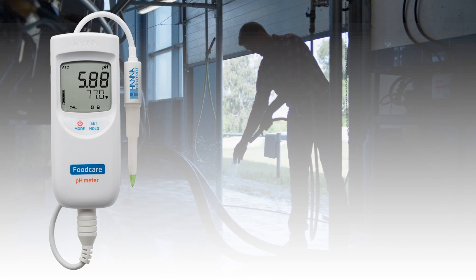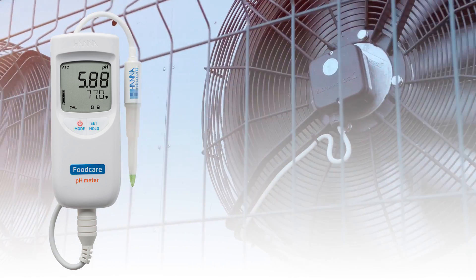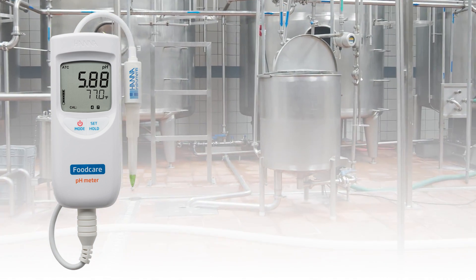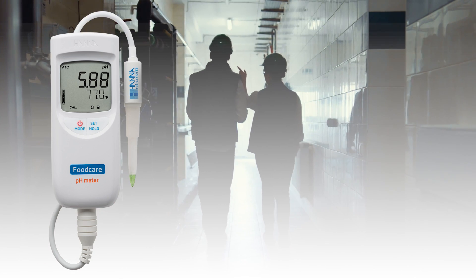It can also be utilized in wet and cold environments down to 32 degrees Fahrenheit, making it possible to spot check in refrigerated sections of your facility without compromising on meter performance.